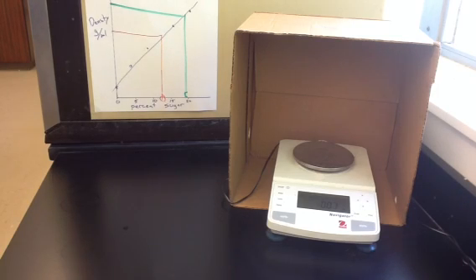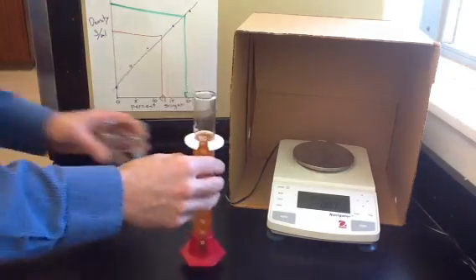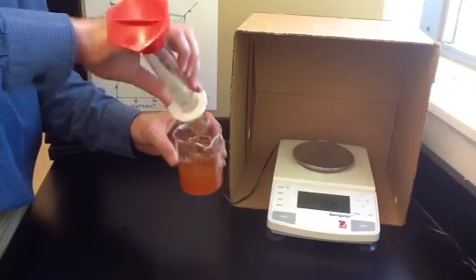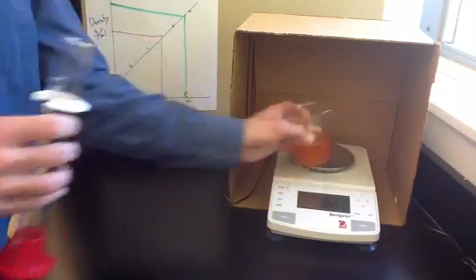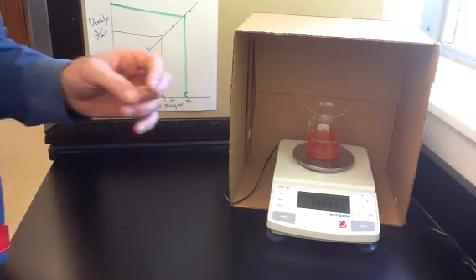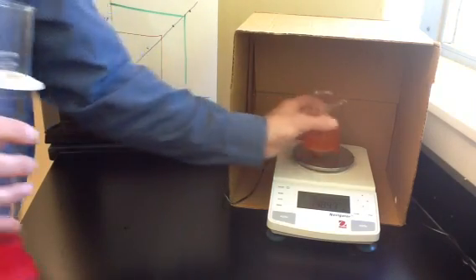So we're going to start with Gatorade. This is the orange flavored Gatorade. We have 100 milliliters measured out. Put it into our beaker here. Put it on the balance. 198.41. 198.41 for the Gatorade.